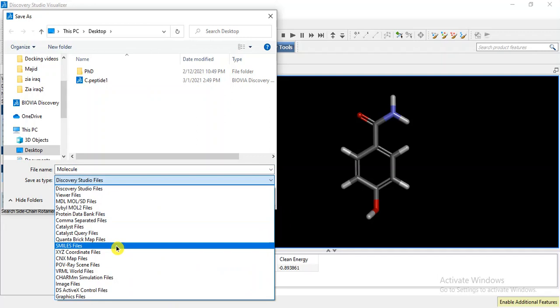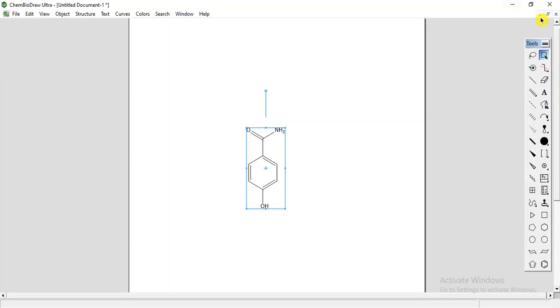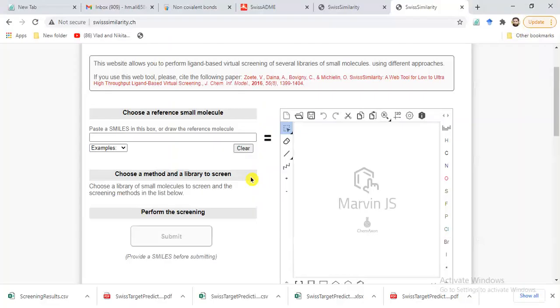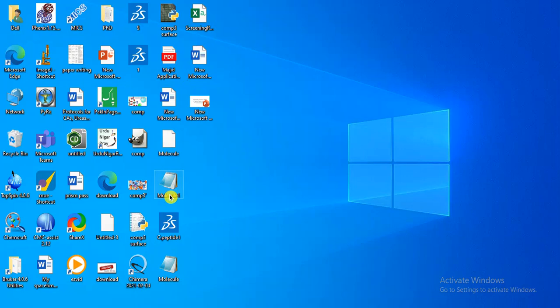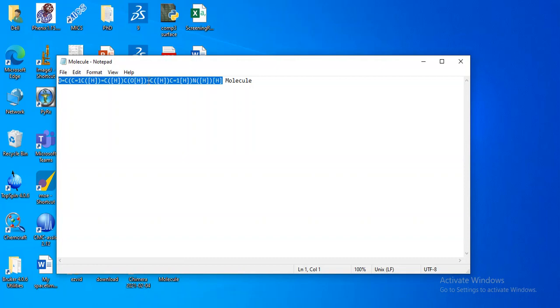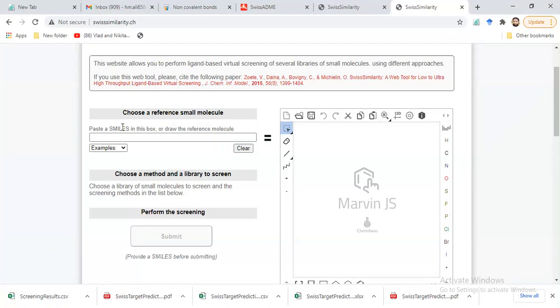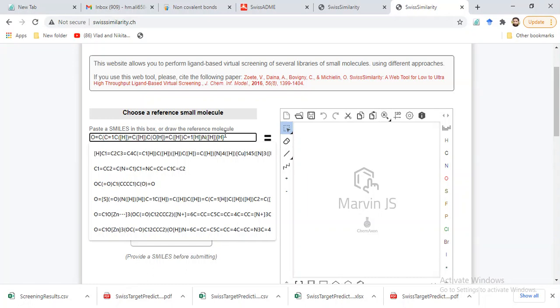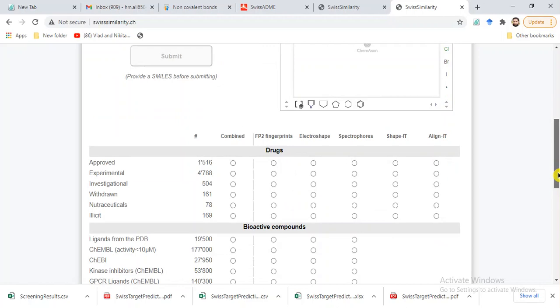I have already saved a file of this compound. Here is our SMILES file. Now copy this file and paste it on the Swiss Similarity online server. Paste it here — okay, this is our file. Now let's see how we are going to perform the screening.